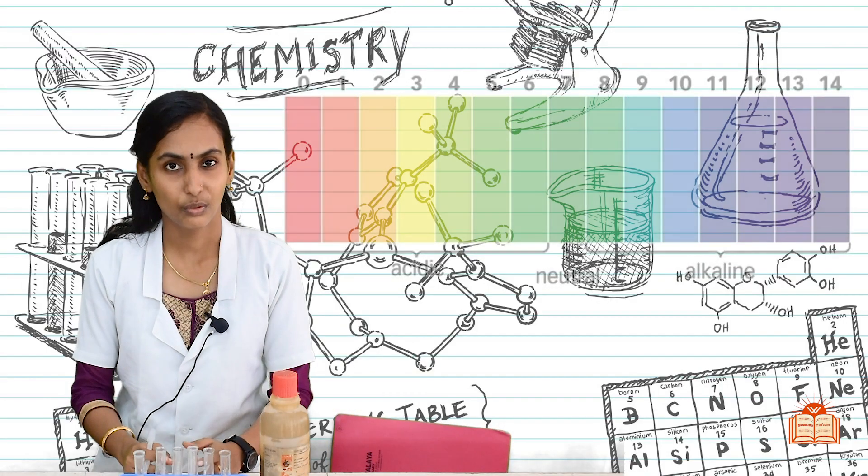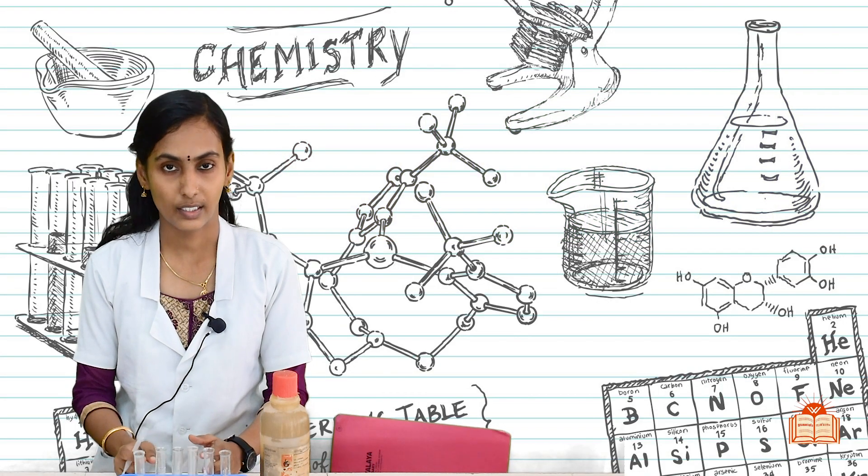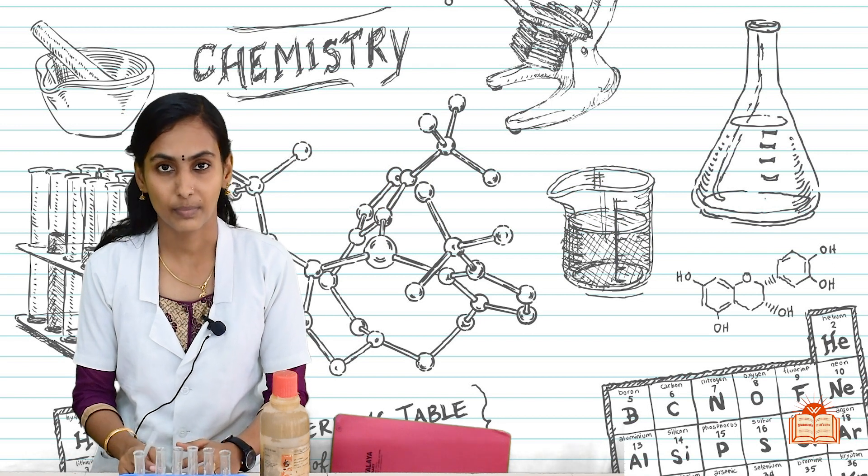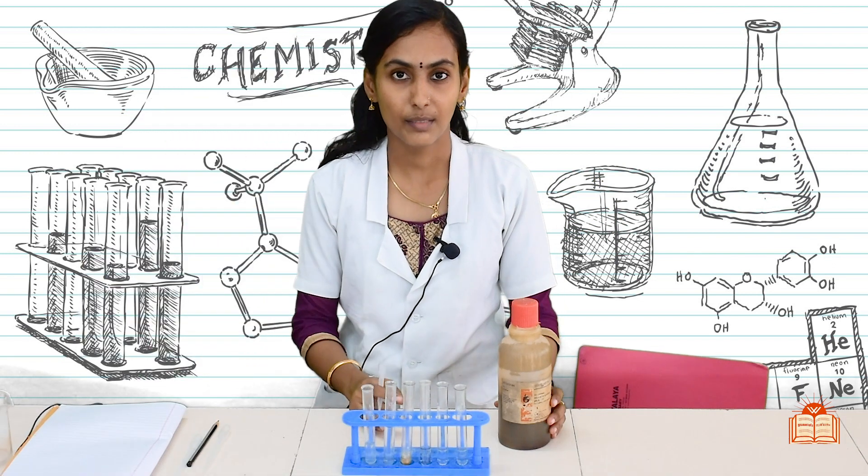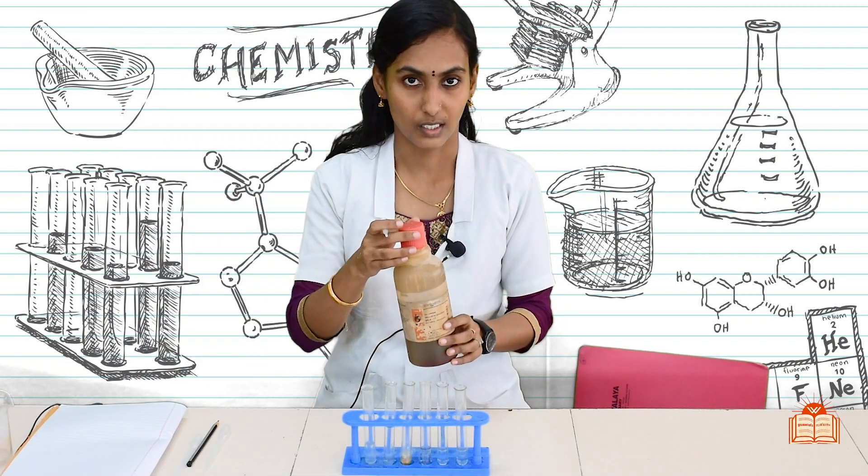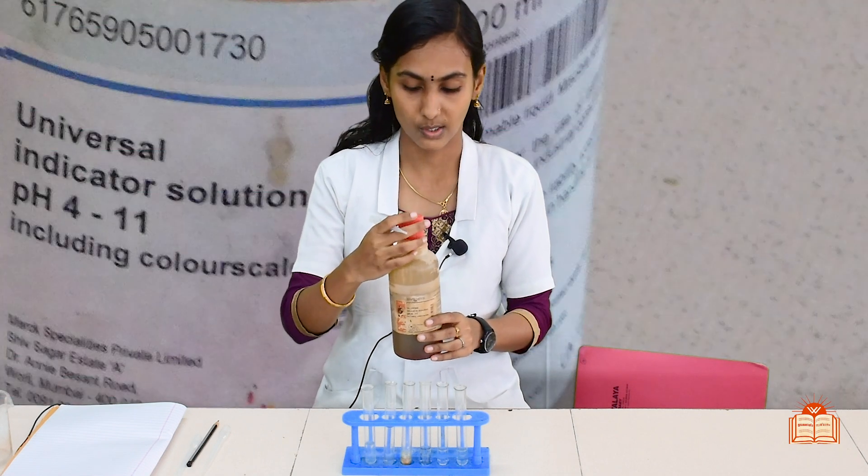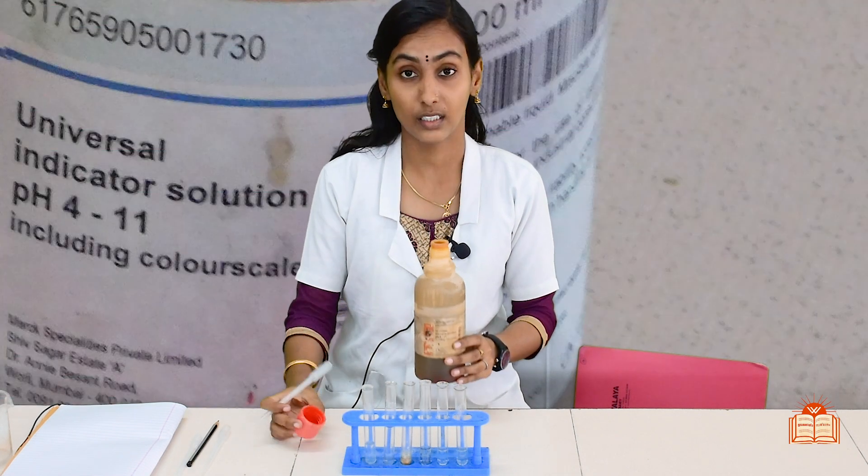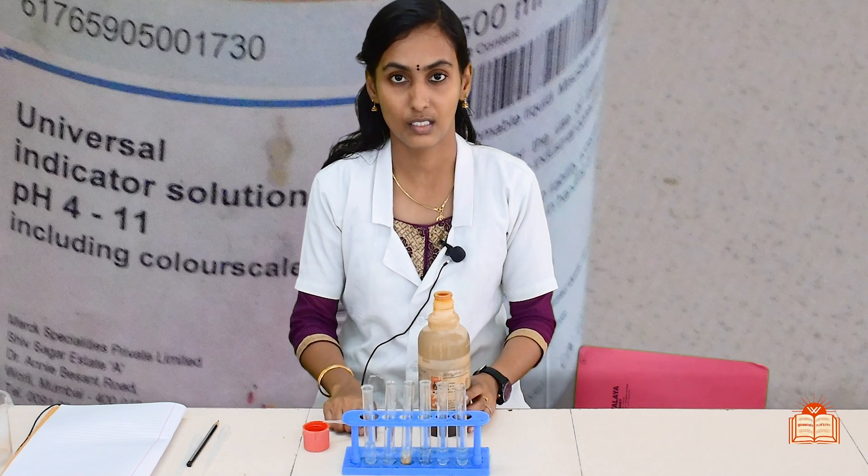Ok students, so far we have done our experiment using the pH paper. Now we will do the same experiment with universal indicator solution. This is actually a mixture of very many other chemicals, many colored substances.